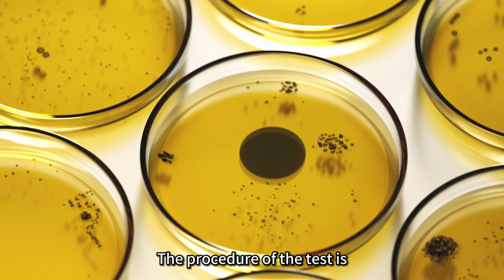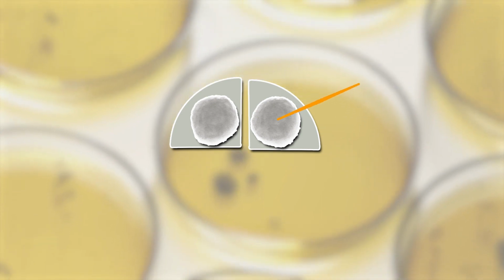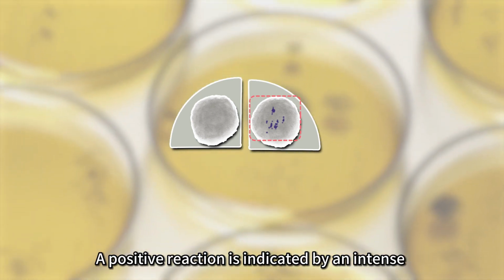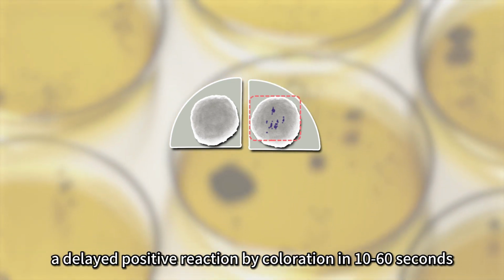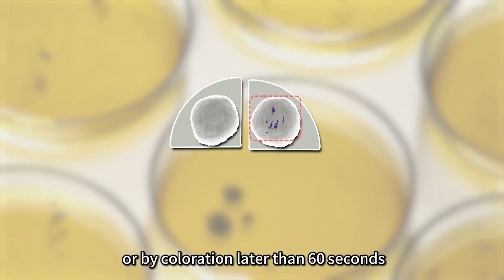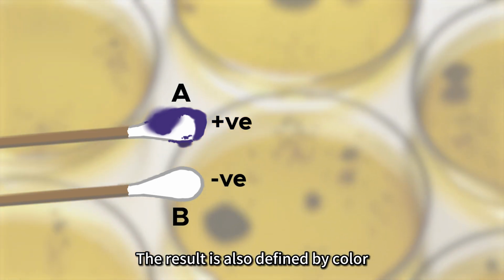The procedure of the test is: add a few drops of the solution to filter paper, remove a colony from the blood agar plate using a sterile toothpick, then smear it onto the moistened filter paper. Then you can check the color. A positive reaction is indicated by an intense deep purple hue, appearing within 5 to 10 seconds, a delayed positive reaction by coloration in 10 to 60 seconds, and a negative reaction by absence of coloration or by coloration later than 60 seconds. Oxidase test can also be done with plate, swab, or test tube. The result is also defined by color.